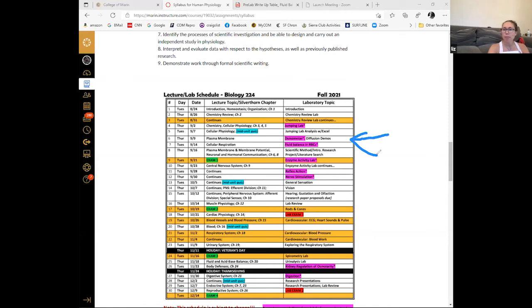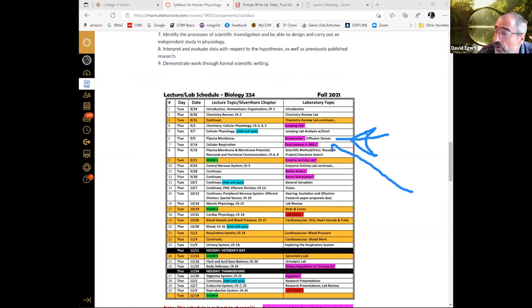Okay. So what I would like you to do is just look at it and do that. This doesn't need a lot of hand holding, so I'll just let you do the osmometer and diffusion thing. Sometime before Tuesday, you should come up with your hypotheses for this other one. And then there is no lab officially on that Thursday. We'll talk about stuff, but we're not going to do anything.